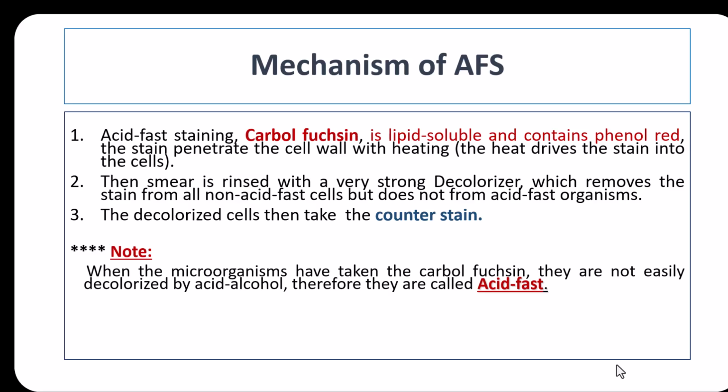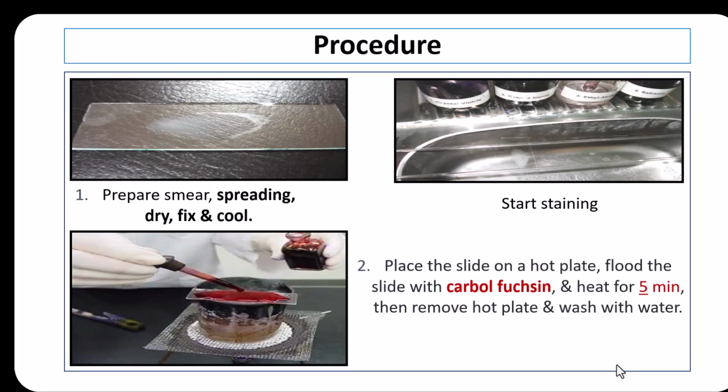Why is it called acid-fast? Because once the acid-fast bacteria absorb the carbol fuchsin, they cannot be easily decolorized by acid alcohol. That's why it's called acid-fast. What about the procedure? I will also provide a video that shows the procedure.